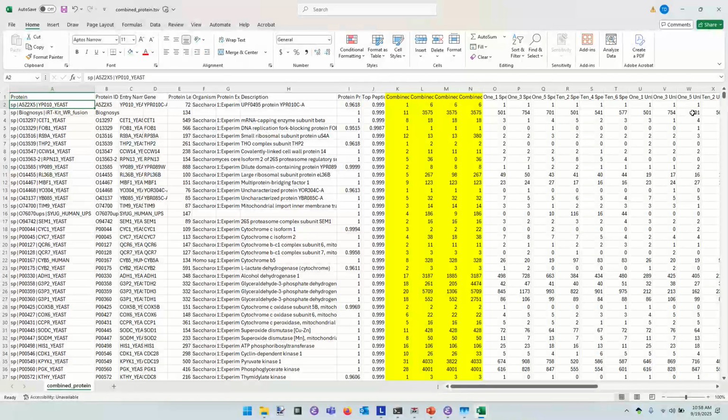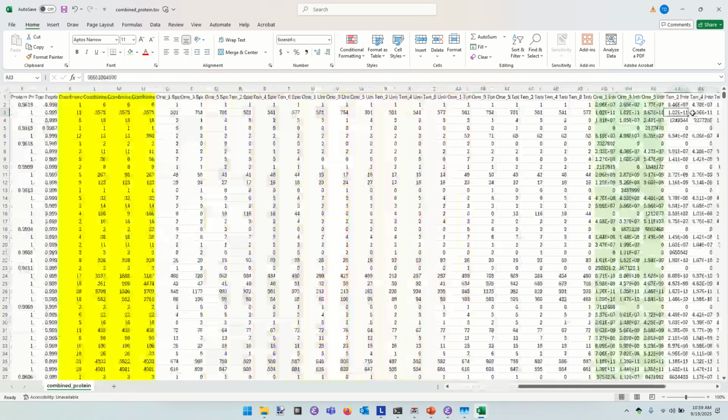Like the second row, you have 11, 3, 5, 75. I have 11, 3, 5, 32, 4... Yeah. 9, 8, etc. Did you freshly install FragPipe for the class? Yes. Okay, so I have version 22 and you have version 23. Yeah. So there are small changes to the software deployed, and that's well within normalcy, I think. Yeah. Oh, but no, it's worth pointing out.